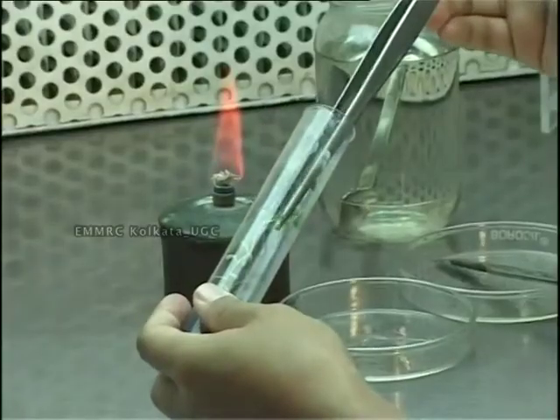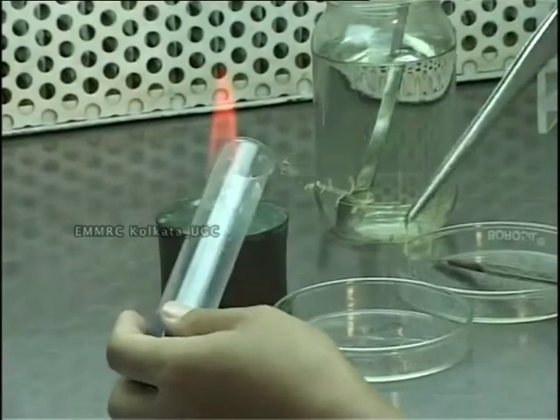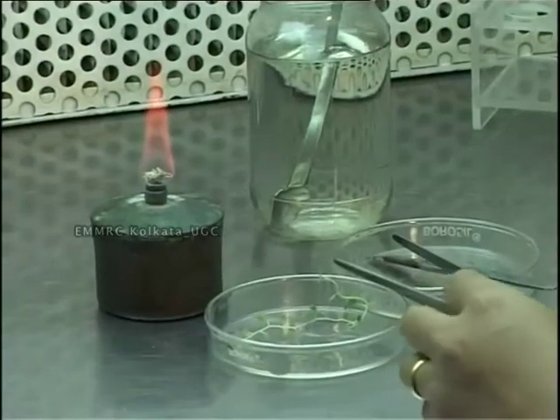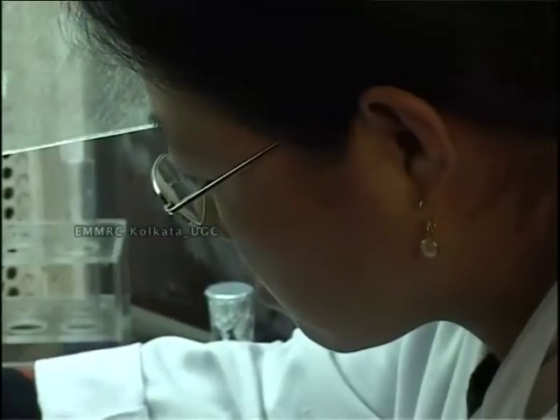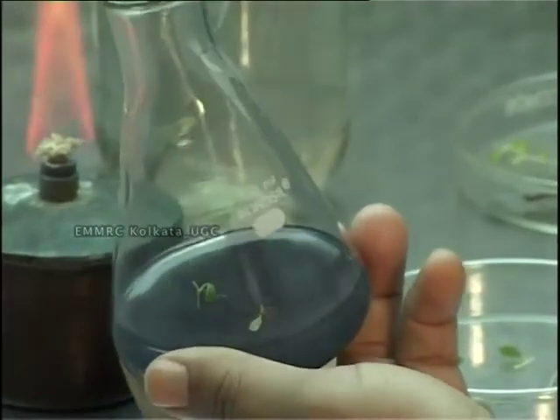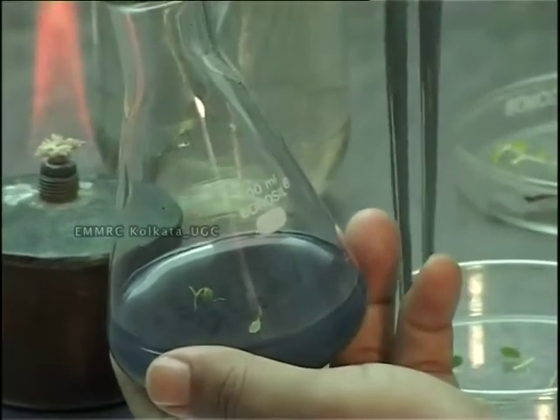Plant tissue culture refers to a method of multiplying plants from very small parts of the plant, such as buds, nodes, leaf segments, root segments, etc., in a controlled environment.